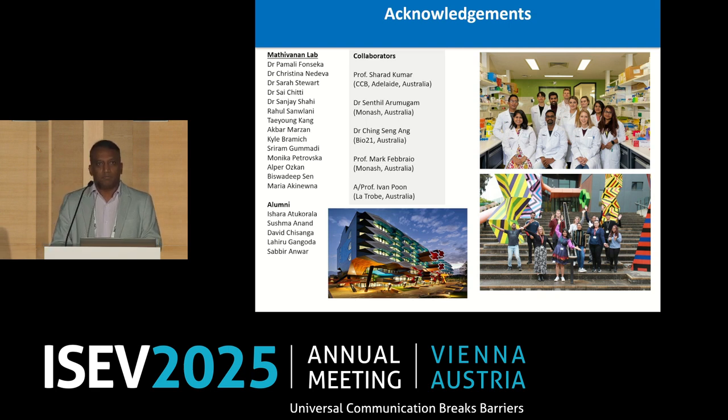Okay. Hey, Suresh, thank you for the talk. I had a question. It's more a complaint from the mass spectrometry facility in my new institute. They are using databases like Vesiclepedia, etc. And I try to explain to them that most of the data in these databases come from poorly isolated EVs, and sometimes we don't know exactly whether that's EVs or not.